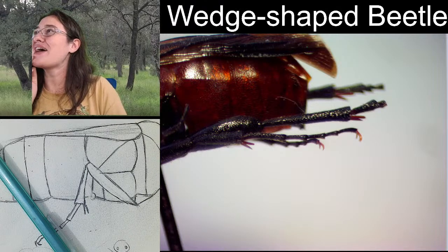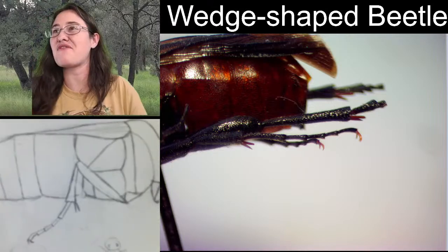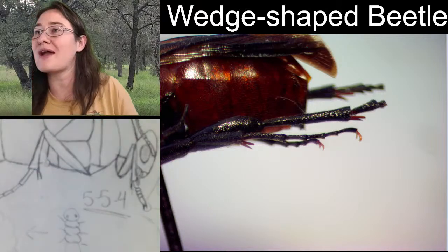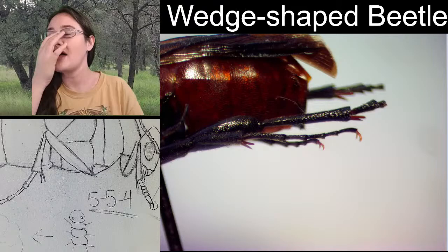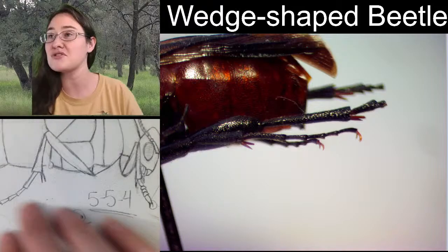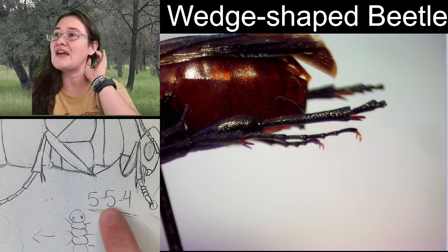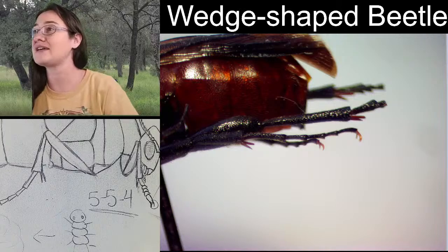Interesting. So that's kind of cool that wedge-shaped beetles have a 5-5-4 tarsal formula. It's funny because we regularly see 5-5-5 or 4-4-4. Generally, they're going to have similar tarsal numbers, front, middle, and hind. But when you see a 5-5-4 tarsal formula, that means 5 tarsi on the front leg, 5 tarsi on the middle leg, and only 4 tarsi on the hind leg.